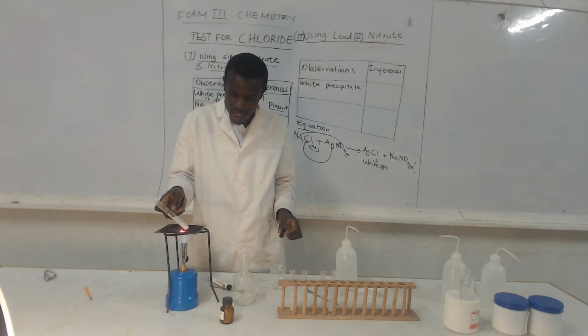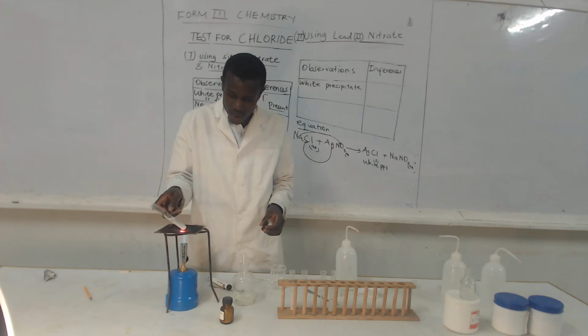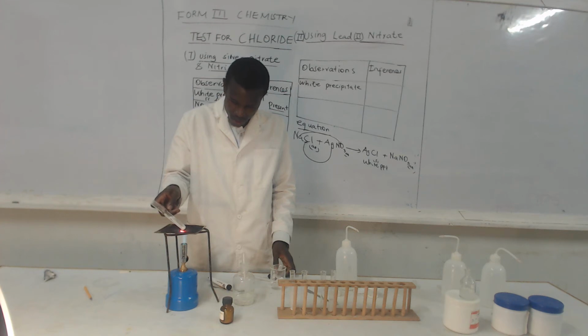Remember, we have added lead nitrate, and now we are warming to enable us see what would happen upon warming. You must be very careful and patient.